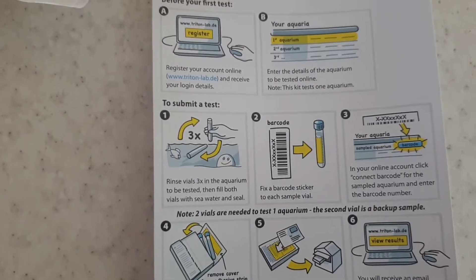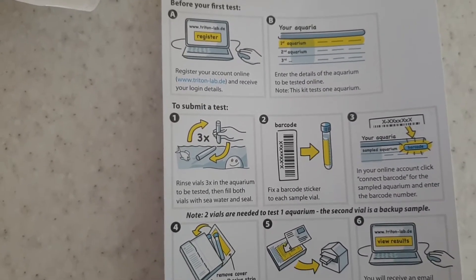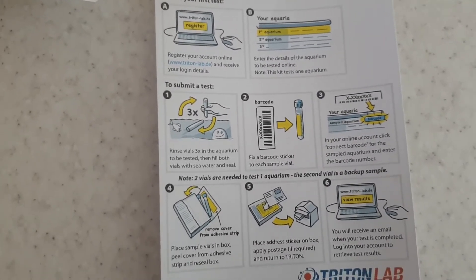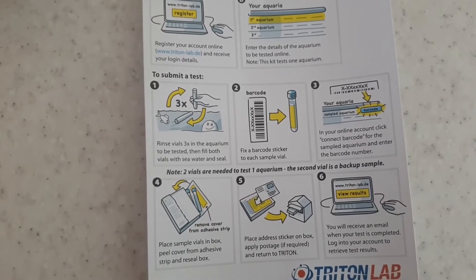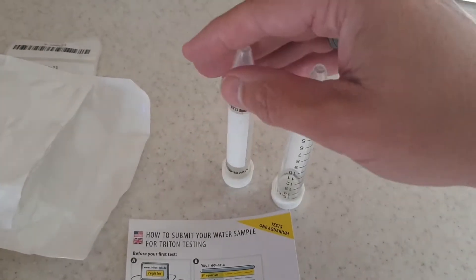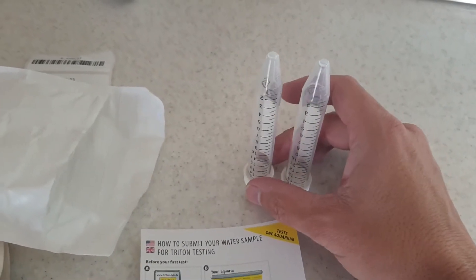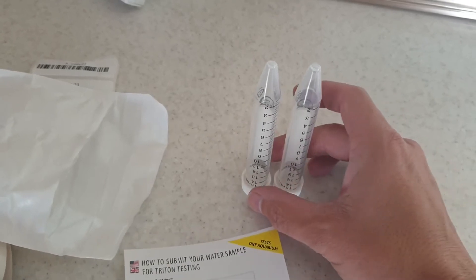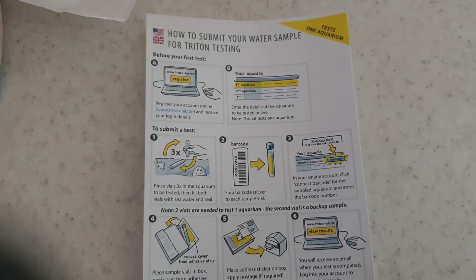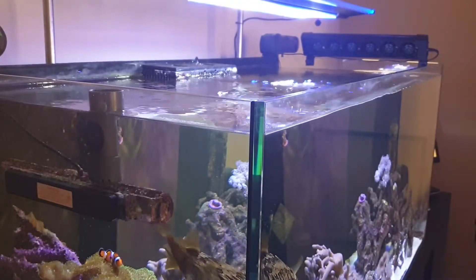So we've got two little vials, an instruction manual. What we have to do first is go online and register. Once registered, we can fill up the vials — we've got to wash them through three times before filling both up, stick the barcode sticker on, and put them into the supplied little envelope bag and post it off. The two vials are provided as a backup in case one gets damaged.